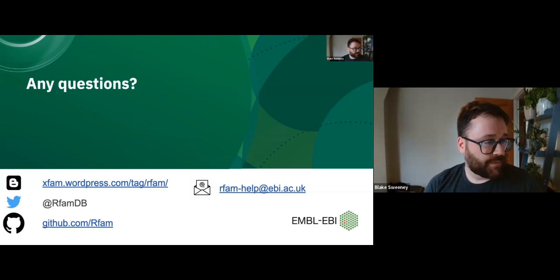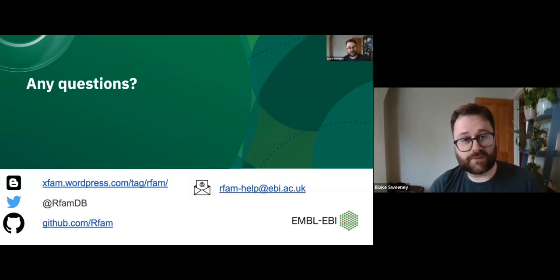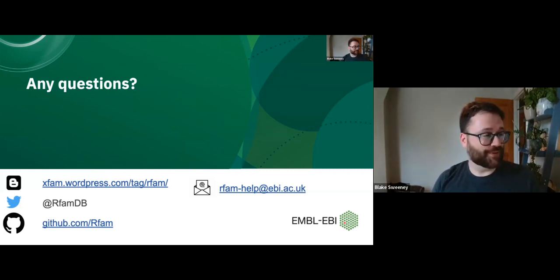Can we annotate in amoeba? Yes, if we had an amoeba sequence and we ran that CM scan, we would have the annotations in amoeba. It's the same command regardless of species, and you will get matches. So yes, it will. I don't know what non-coding RNAs are in amoeba. I'm not familiar with amoeba in general.